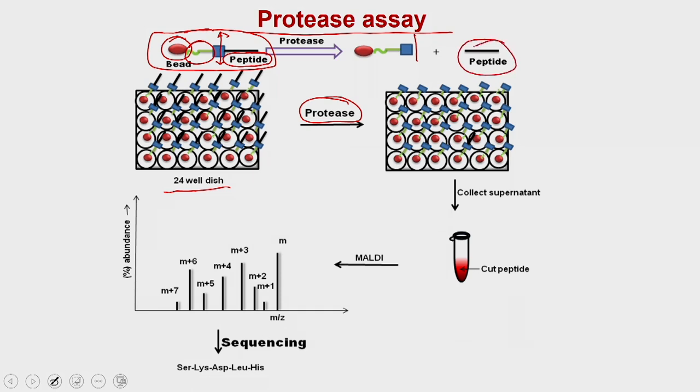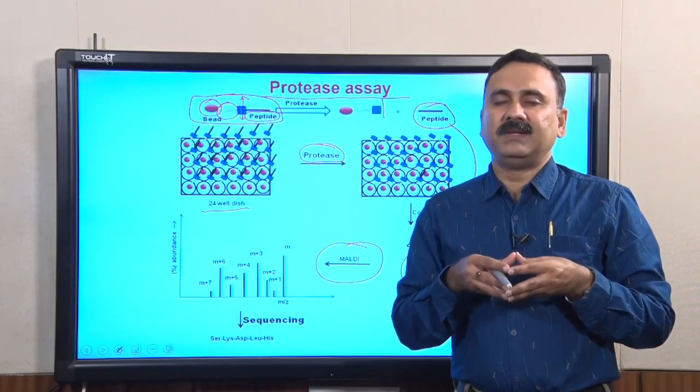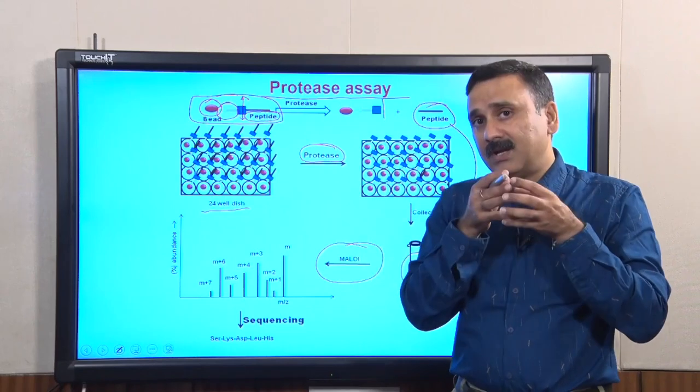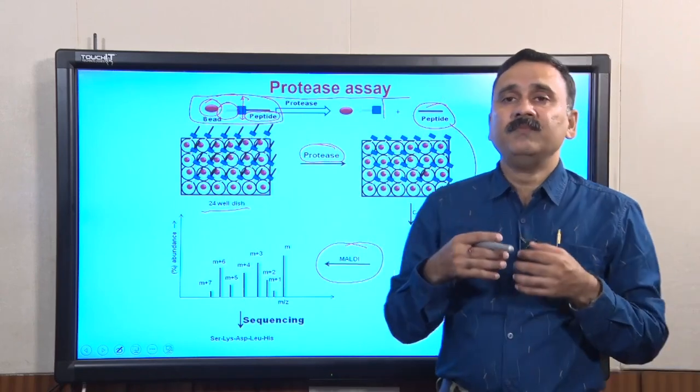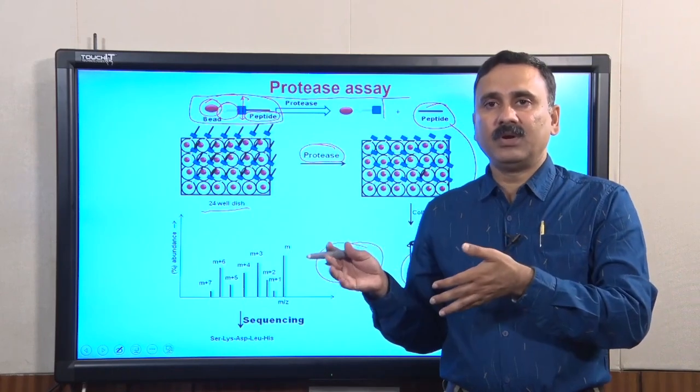This peptide you can collect into the supernatant from all the beads, all the wells, and then you can perform the MALDI analysis, which means you can collect these peptides and do a mass analysis. Depending on this mass profile, you will be able to deduce the sequences or the places where the protease is cutting in each well, and depending on this analysis, you will be able to determine the cutting site of that particular protease.